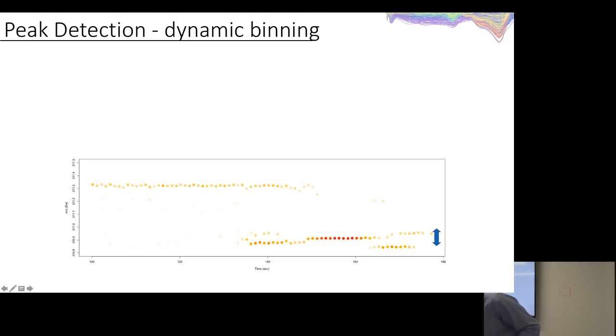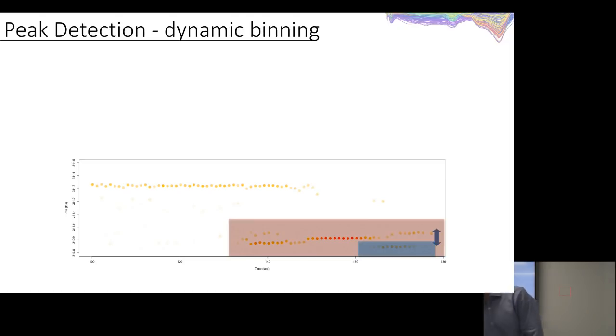compounds coming out here. So you can see that there's one compound here with a line of different peaks which are being found, or centroids. And then here's another set. And there's another one which is very, very close here. I'll just do that on the board, this one right here. And again, what we're able to do is identify that that is indeed some sort of unique feature, and that also this is another one right here.